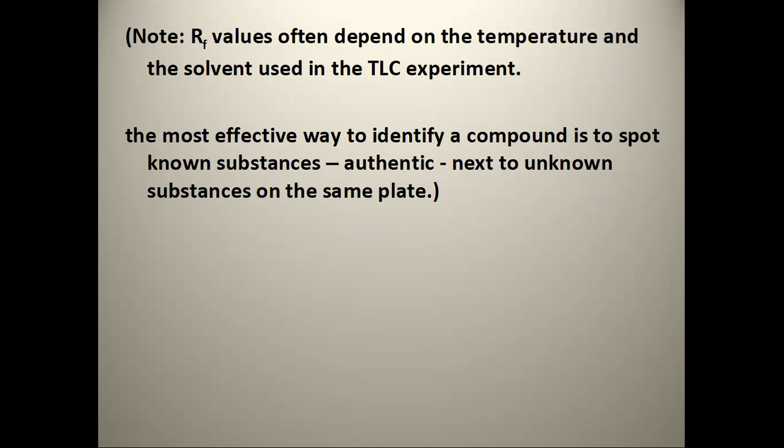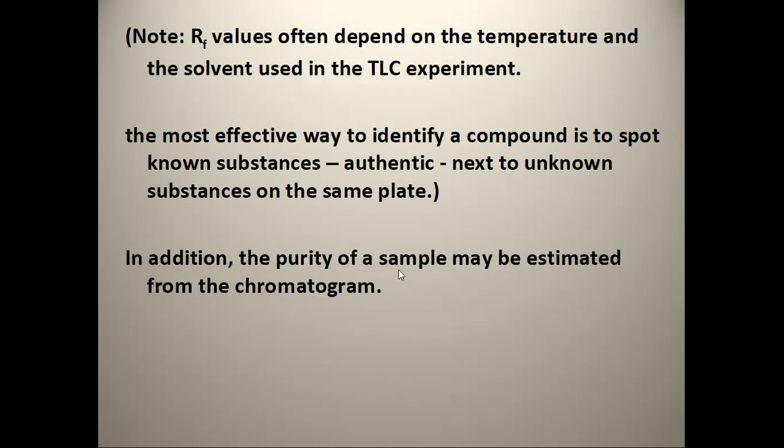So these are authentic next to unknown substances on the same plate, sorry. Okay, so parang kino-compare natin. Kung alam natin na nandun yung component, we know the RF value. So maspot mo yun sa mismong chromatogram or yung paper or TLC.